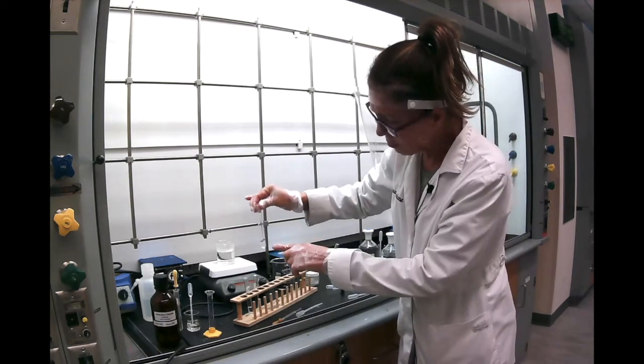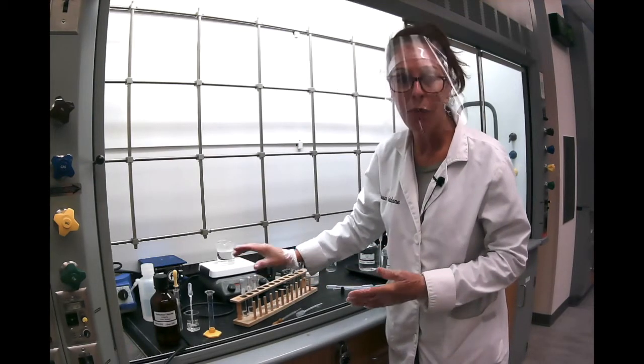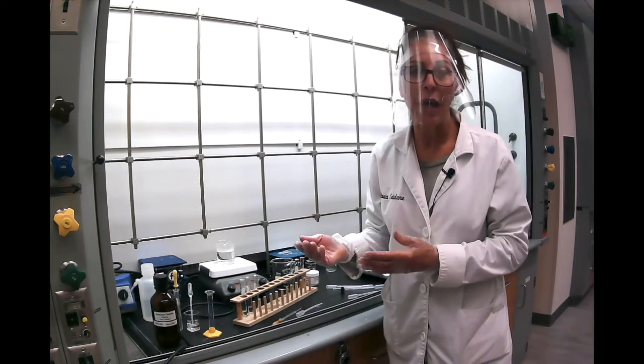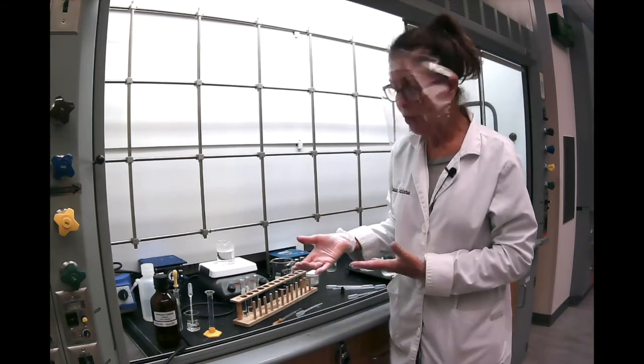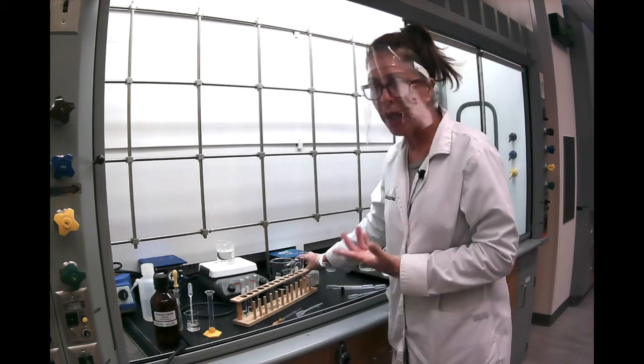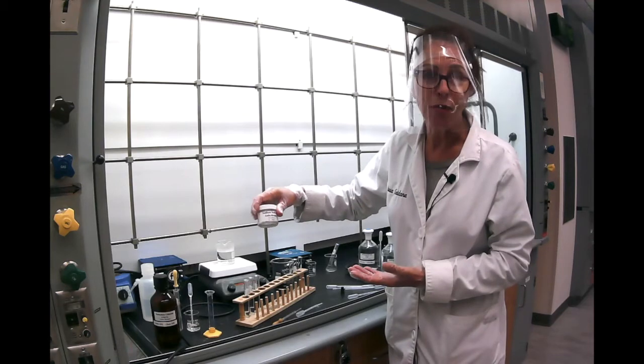But there's still some residual water in there. And when we do extraction, as you read in the handout, the last step is to remove that residual water. So you need a drying agent, and in this case, it's sodium sulfate.